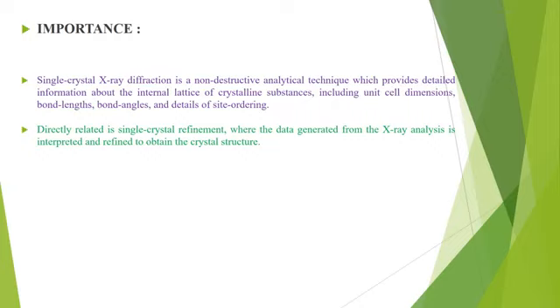It provides information about unit cell dimensions, bond lengths, bond angles, and also site ordering. It is directly related to single crystal refinement, where the data generated from the X-ray analysis is interpreted and refined to obtain the crystal structure.